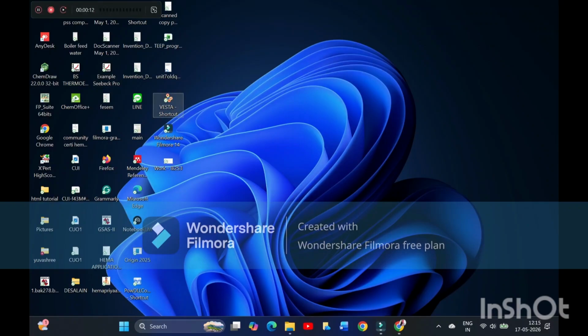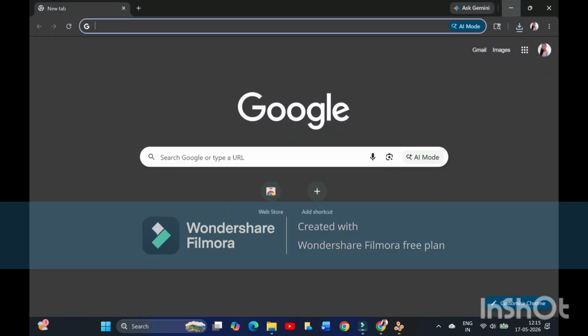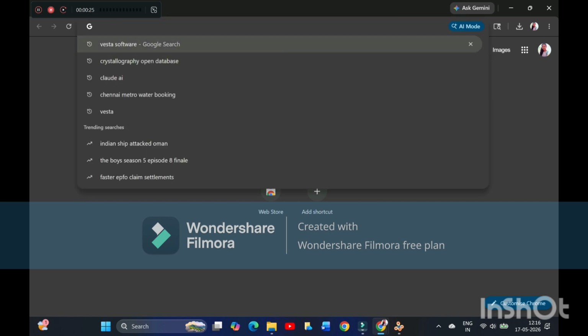Hello guys, in this video we are going to see about the software VESTA. It is a structural analysis software. We can extract the reference XRD data using this software, so from CIF file to reference data.